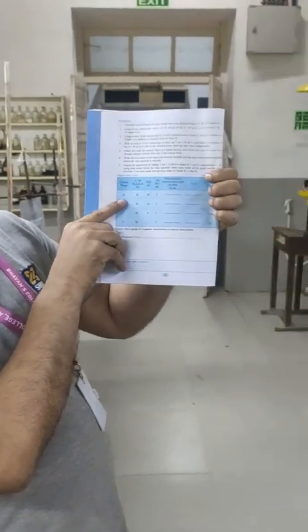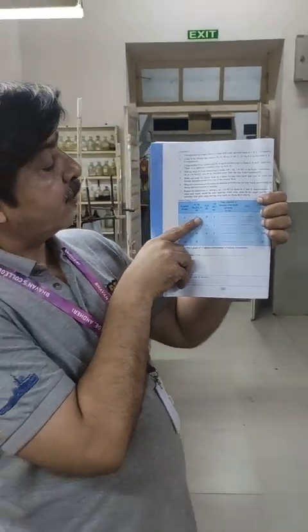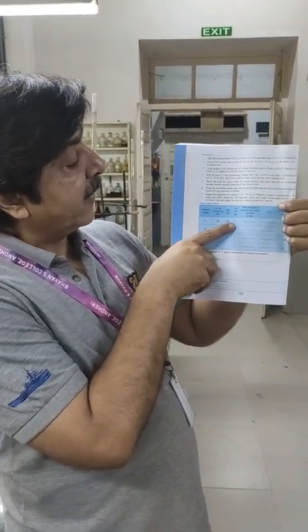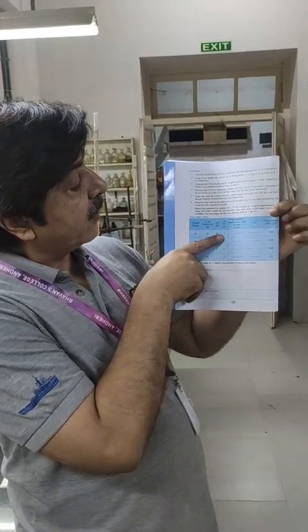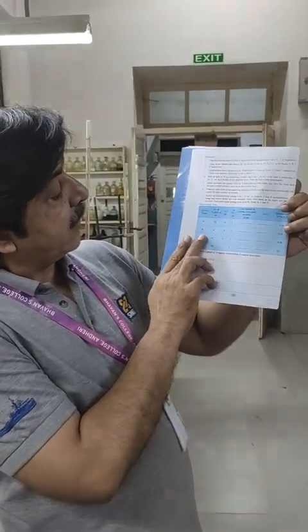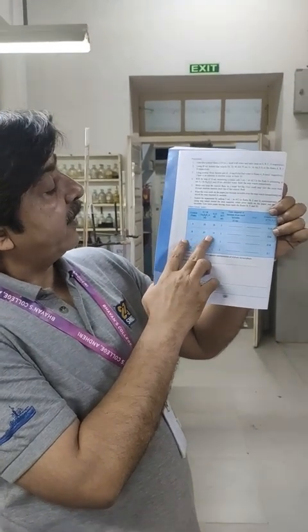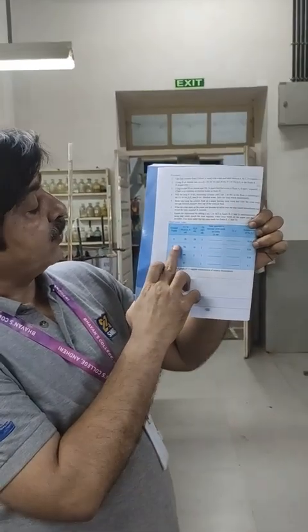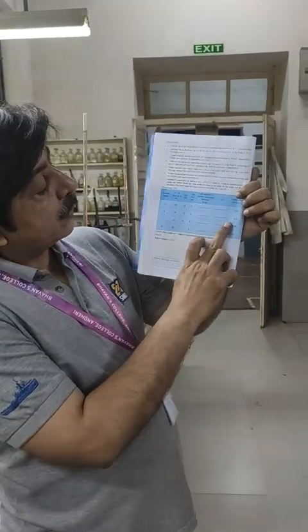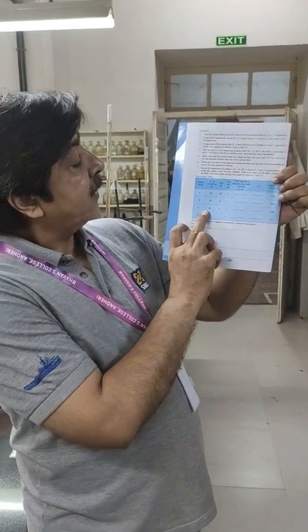Now, friends, we have taken 4 readings. In the first case, we had taken 0.1 molar sodium thiosulfate 20 ml. To that we have added 28 ml of distilled water and we had added 2 ml of 1 molar HCl. The resultant molarity was 0.04 molar. Similarly, for set B, second reading, 30 ml sodium thiosulfate, 18 ml water and 2 ml HCl. Total, this will be 30 plus 18 plus 2, 50 ml. Total resultant molarity will be 0.06 molar.